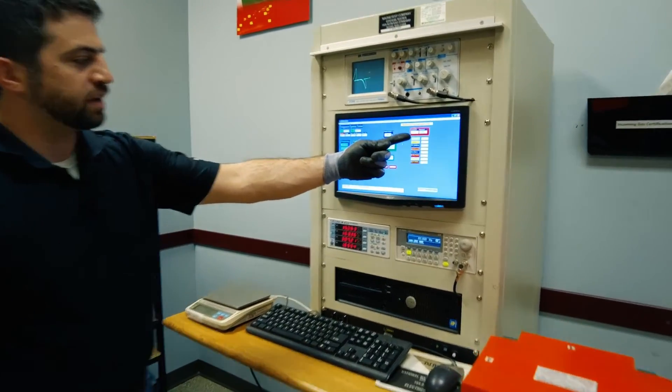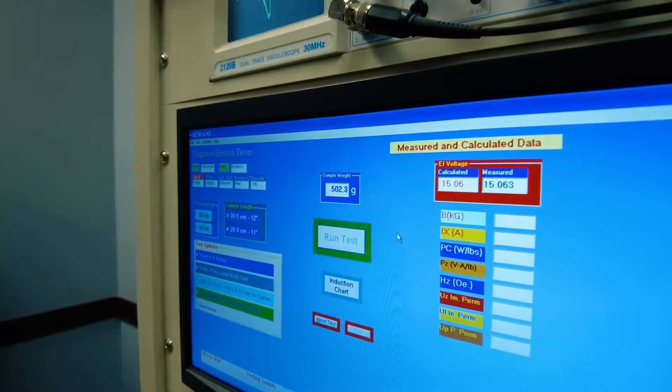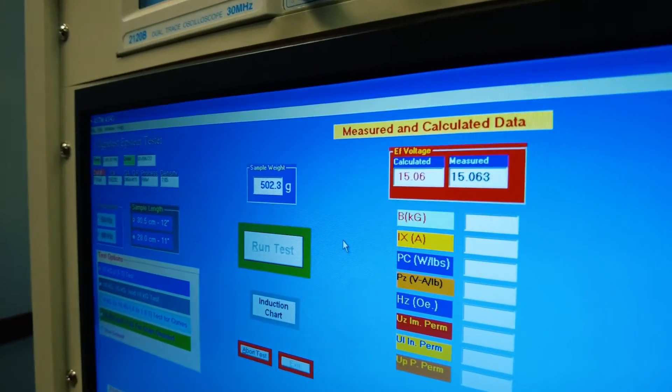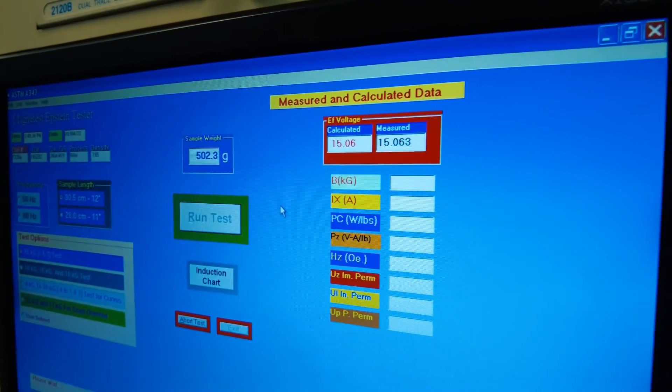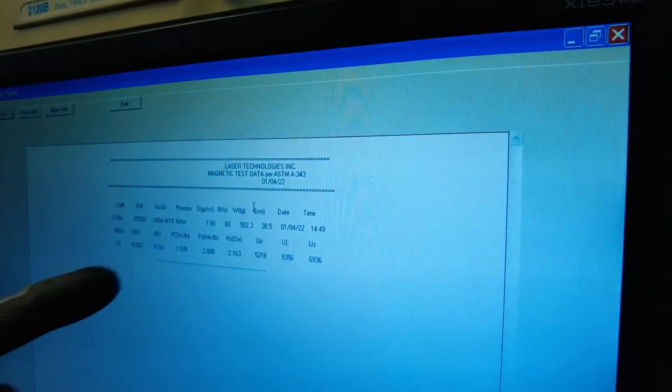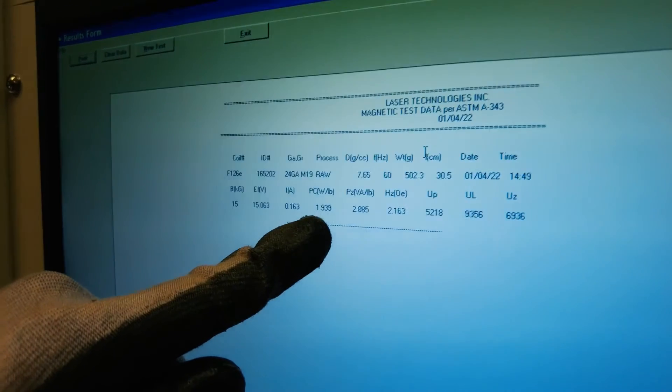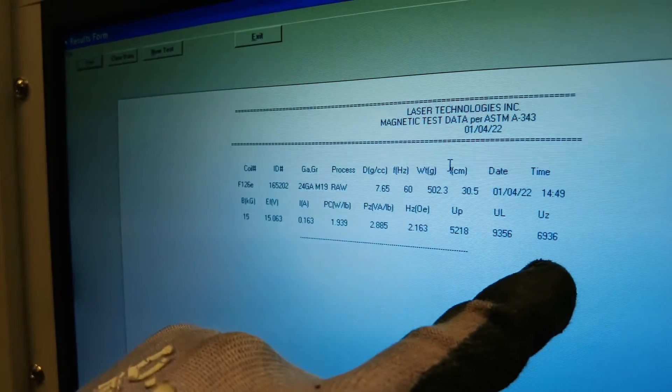You'll see here a calculated voltage versus our actual measured voltages. Once the test is complete, all the parameters will be filled in, and we'll be looking specifically at the watts per pound core loss as well as various permeability numbers.